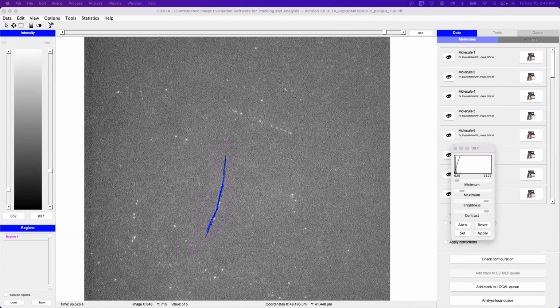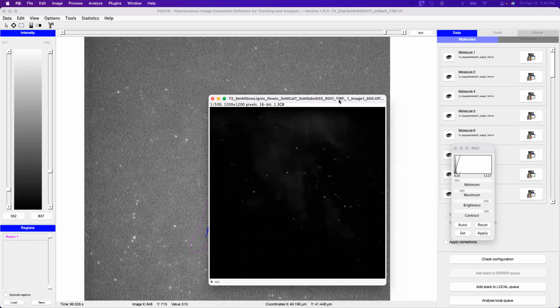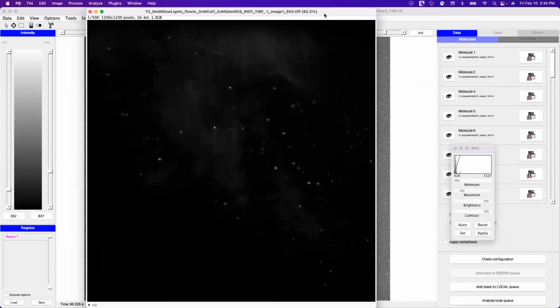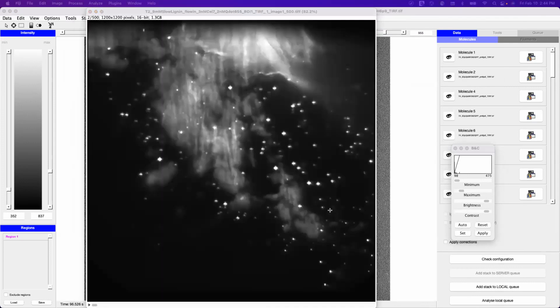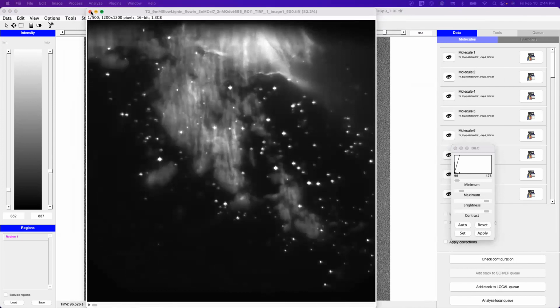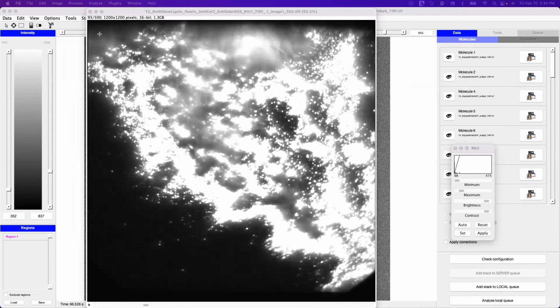It changes the result in the precision data. But you will have the same movie, right? So like this, you see, that's not Joe's code. It's not actually drift correcting the movie.